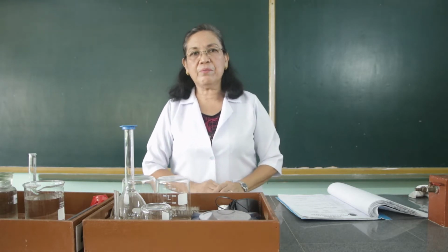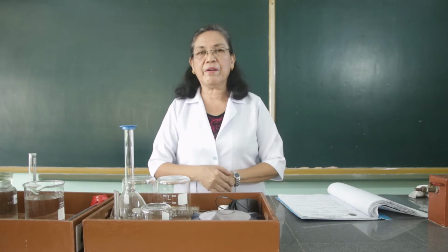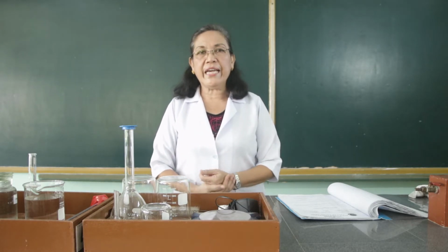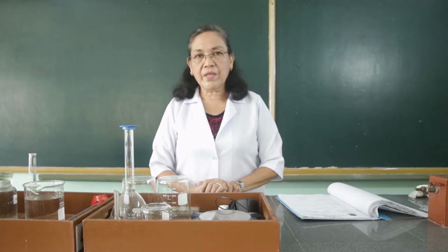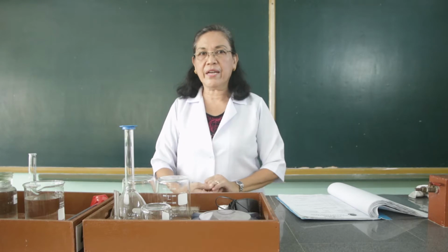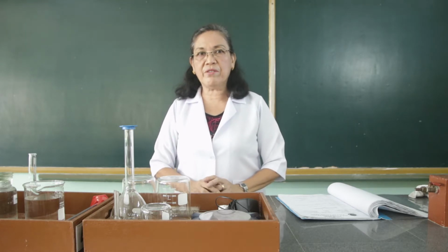Today, we're going to prepare the common laboratory reagents. Actually, this is activity number 11, and we are going to prepare the common laboratory reagents such as the hydrochloric acid and the sodium hydroxide solution.